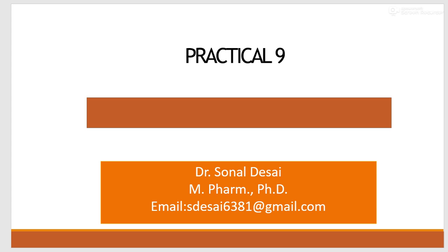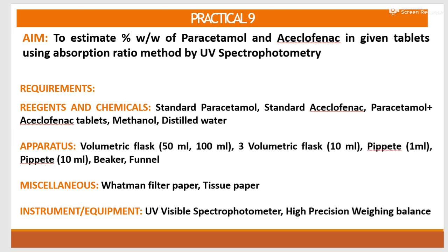Today we will discuss practical number 9, that is estimation of aceclofenac and paracetamol by absorption ratio method. So the aim is to estimate percentage weight by weight of paracetamol and aceclofenac in a given tablet using the absorption ratio method by UV spectrophotometry. Requirements: reagents and chemicals.